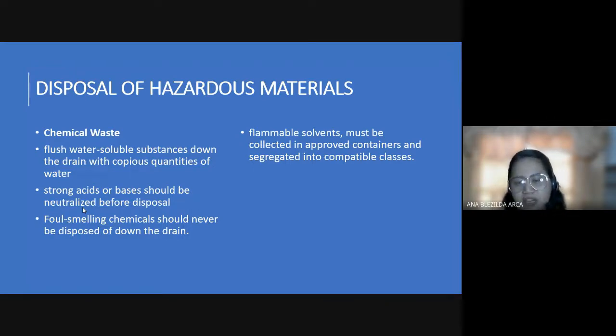Dapat diyan special na disposal. So sino nang bahala sa disposal diyan? Yung mga professional company for disposal of chemical waste. Kaya nga naman sabi ko nga, hindi yan tinatapon kasama ng basura nyo sa bahay. Meron class special na kumpanya na pupunta sa laboratory nyo to collect your chemical waste. And then sila na ang bahala mag-process sa kanilang facility doon.